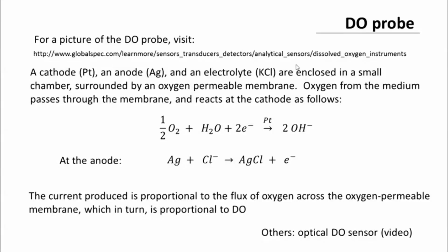In the lecture before that, we had looked at certain bioreactor environment variables that affect bioreactor performance, such as temperature, pH, medium composition, agitation, aeration levels, and dissolved oxygen levels. These are crucial, and so they need to be properly measured and controlled. We looked at some aspects of that, and in particular we looked at the dissolved oxygen aspect.